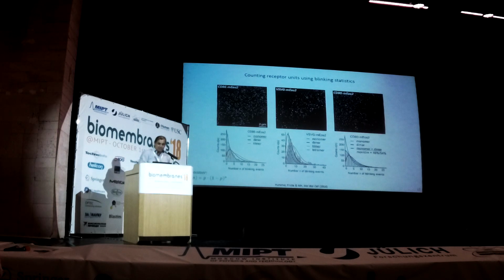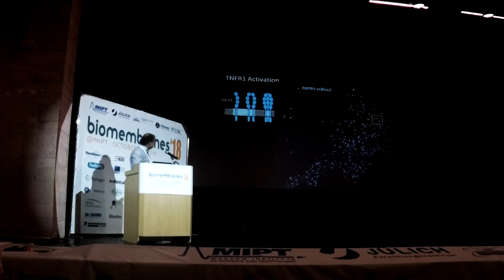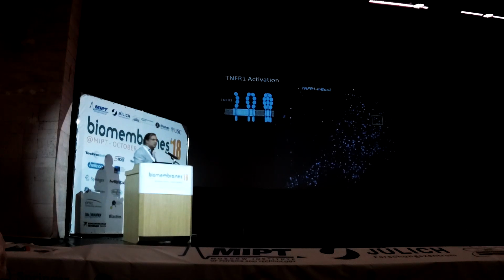Now back to the biology. First of all, TNF receptor 1, where it all started. Let's go back to these questions I asked you earlier: whether the resting receptor is monomeric, dimeric, or trimeric.